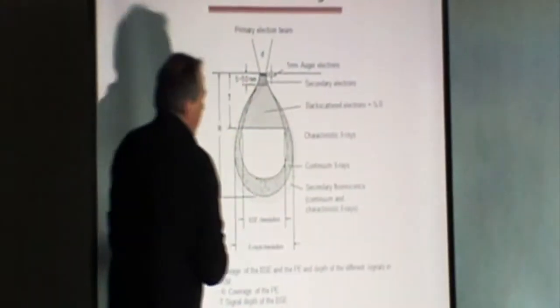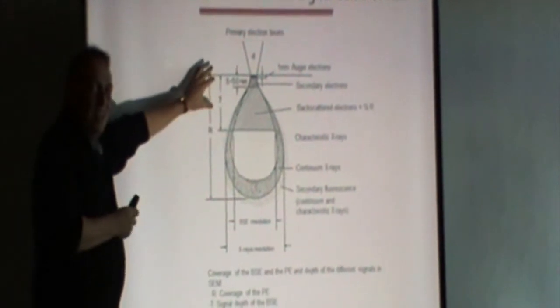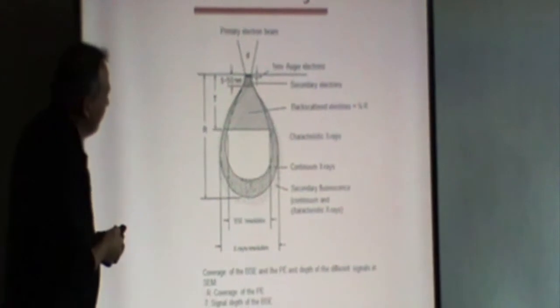So that's why if you buy an electron microscope, Tescan will give you a gold sample to check the resolution, because they will say you get the best resolution on gold, and that's when you check the resolution. Okay.